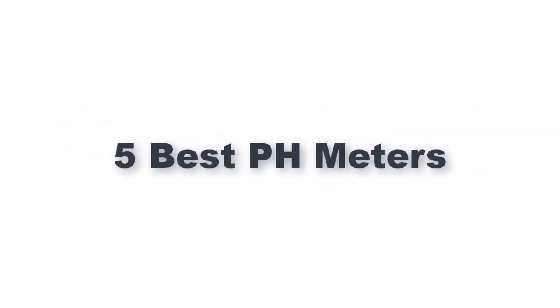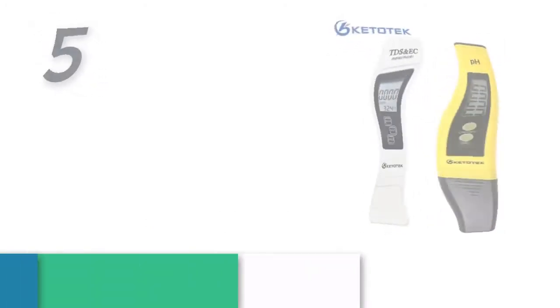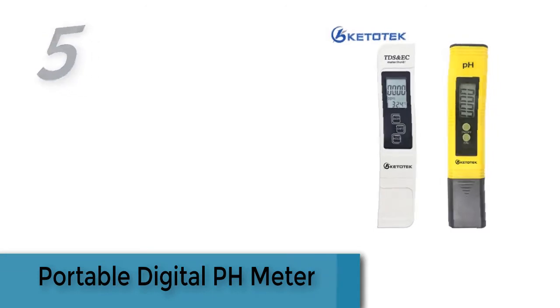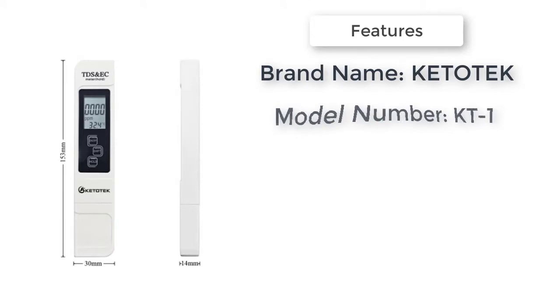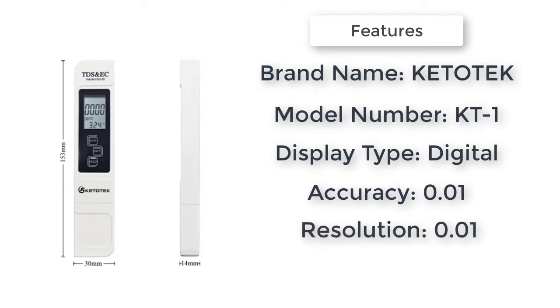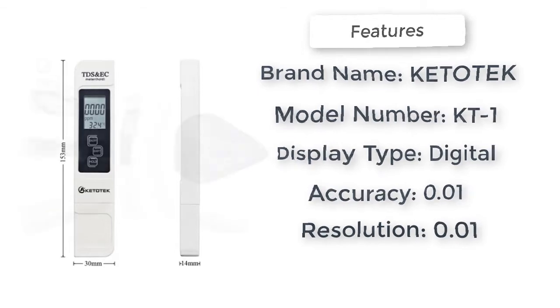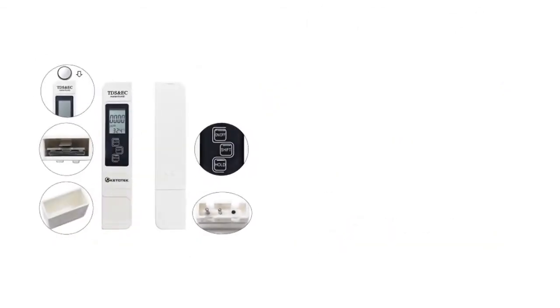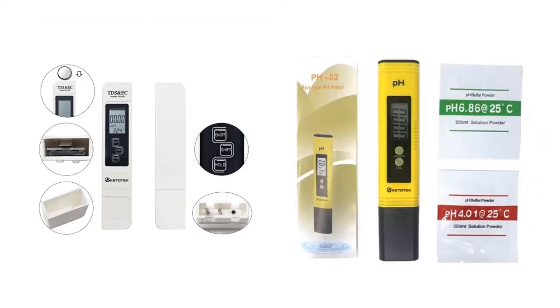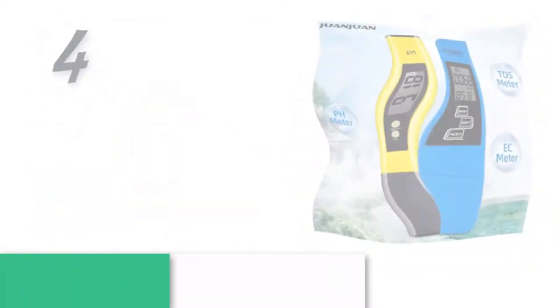Item number five is a portable digital pH meter, 100% brand new and high quality. Brand name: KETOTEK. Model number: KT-1. Display type: digital with backlight — no. Accuracy: 0.01. Resolution: 0.01.